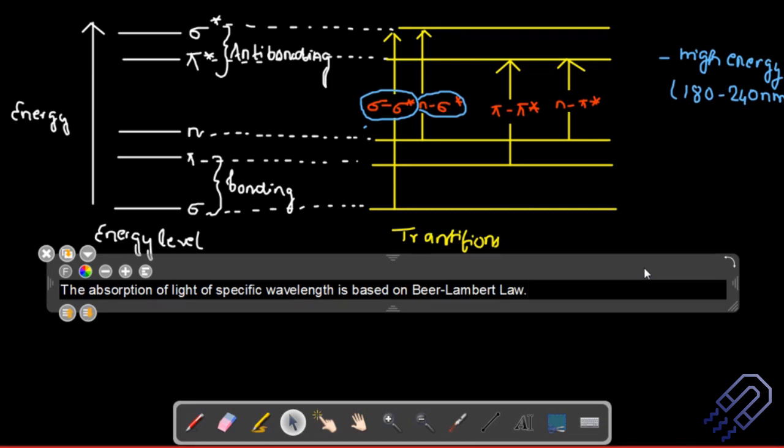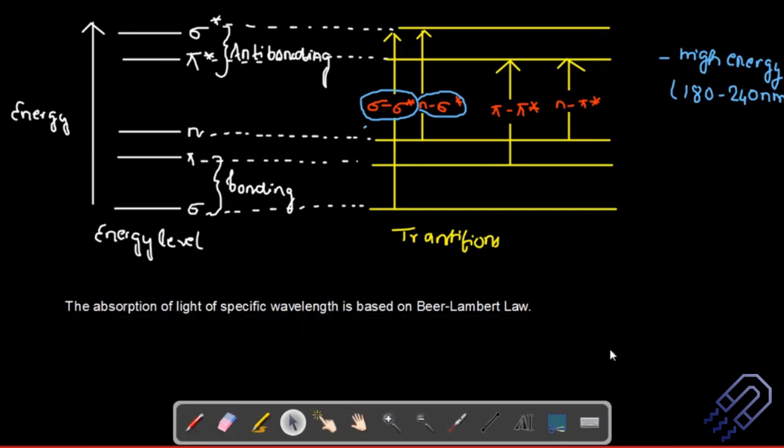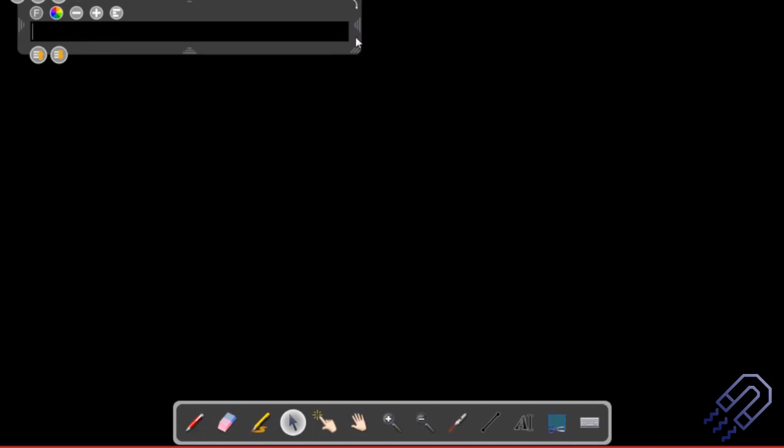Now this UV visible spectra can be recorded by different kinds of devices. The point is, what is the device, how exactly does it work, and so on. The working principle should be very simple because it's more or less natural: light falls on a sample, it gets absorbed and so on. So we're just going to look into the instrumentation part now, and into a bit more detail.